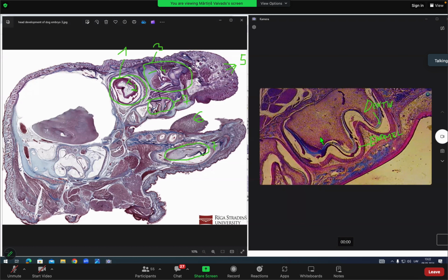So dentin and enamel is visible in the slide. So dentin and enamel. Yes? This is the smallest magnification. The slide, yeah, this is the smallest zoom possible. So these are tricky slides because of their size. These are one of the biggest slides we have. Okay. What else? That's one detail.